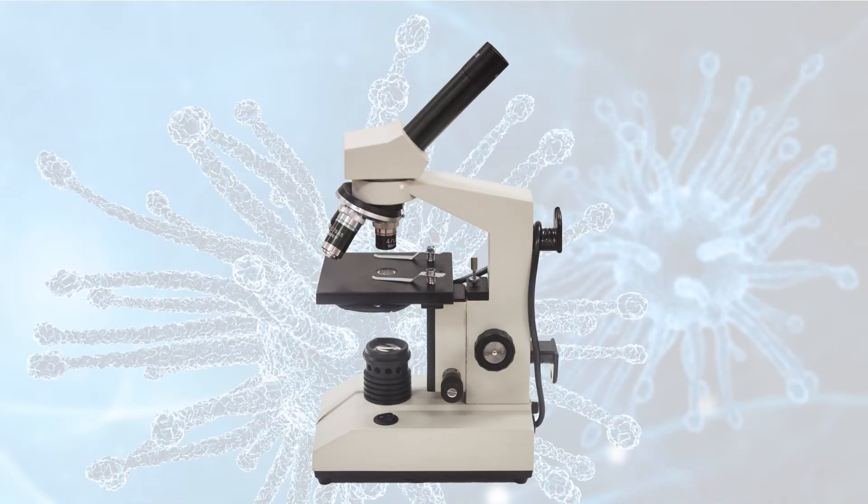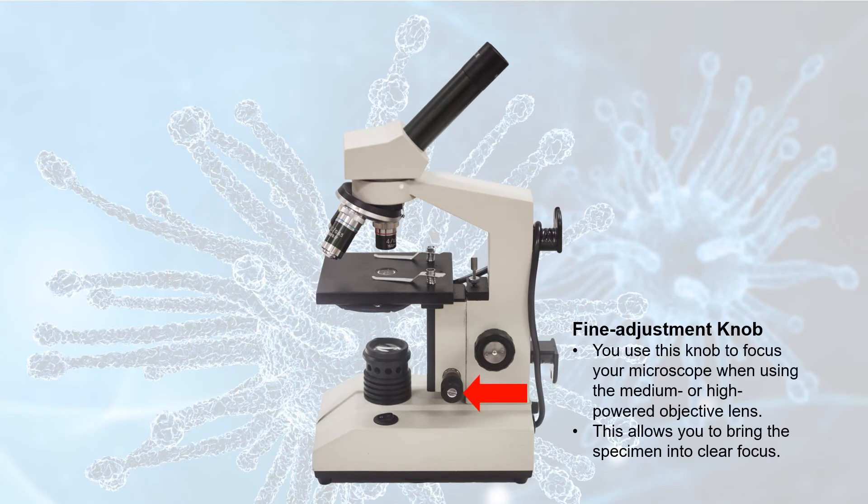When using either the medium or high power objective lens, you can use the fine adjustment knob. That's the small one, right here. And this lets you make sure the focus is nice and sharp.